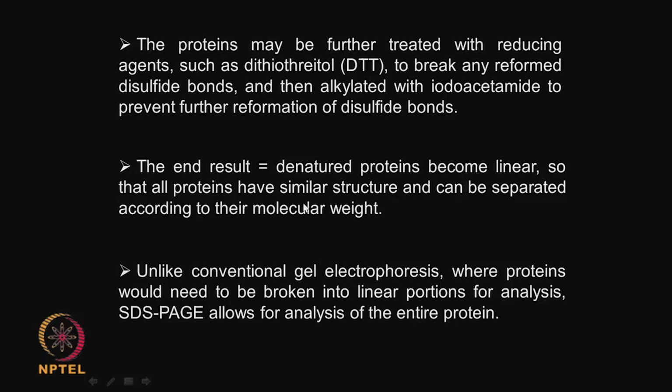So, in SDS-PAGE, you are separating proteins only on molecular weight. You are not looking at the three-dimensional structure, conformation, and so on. Unlike conventional gel electrophoresis, where protein would need to be broken into linear portions, in SDS-PAGE we can look at the entire protein in linear form. That is the advantage.